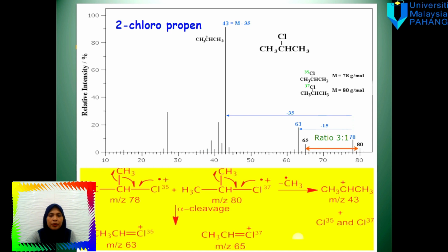Okay, this is chloropropane. This is how we can show the mechanism as heterolytic. Also, it can be shown as homolytic. Both can be shown, it depends. There is no false or wrong, but the mechanism should be logical.